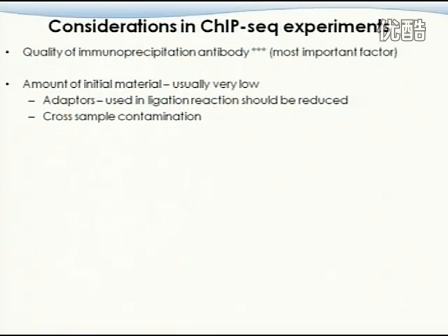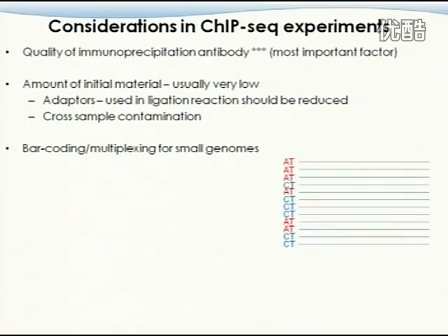And when you do the sequencing, you will see a lot of adapter or primer dimers, which don't have the real information inside. So I heard that initially when people worked on the ChIP-seq experiment, they really had to spend a lot of time to polish their protocols, and eventually they were able to put the fragments they want into the sequencing product. So those are something that you really need to consider.